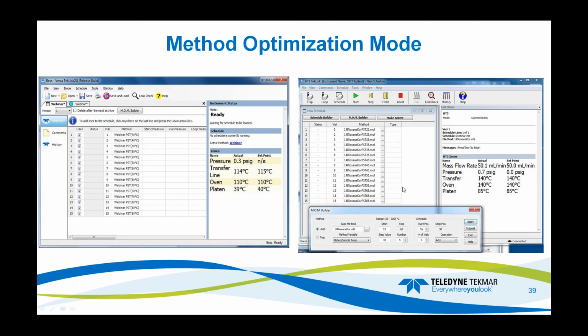Your next step is to put in 15 of your samples that you've selected and press Run. Selecting Start here to begin.